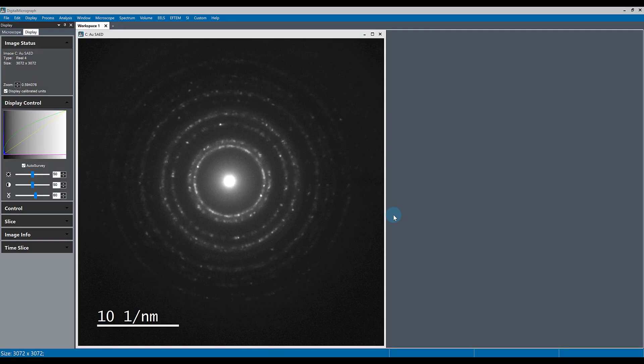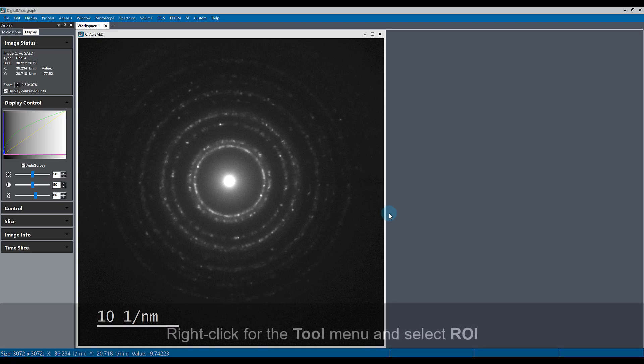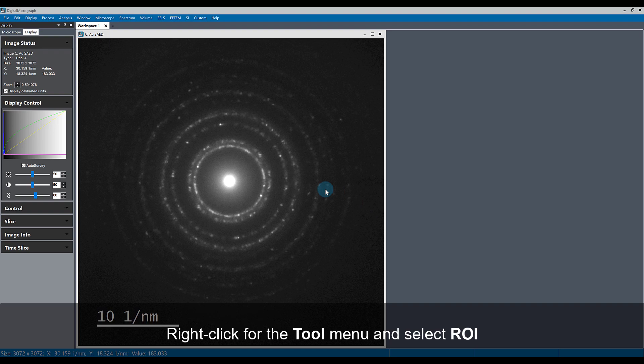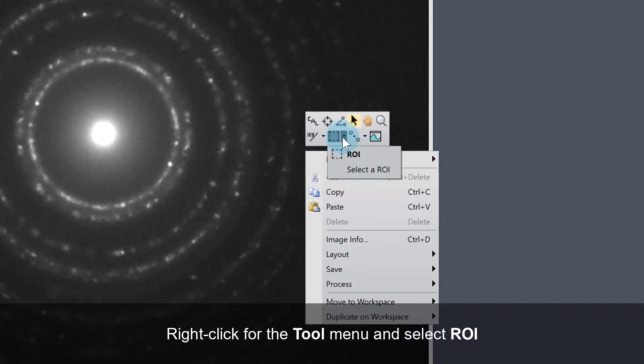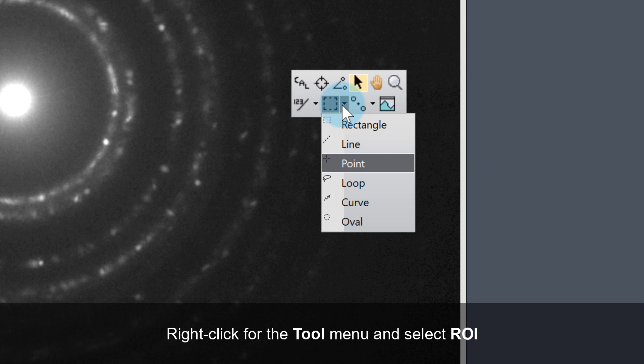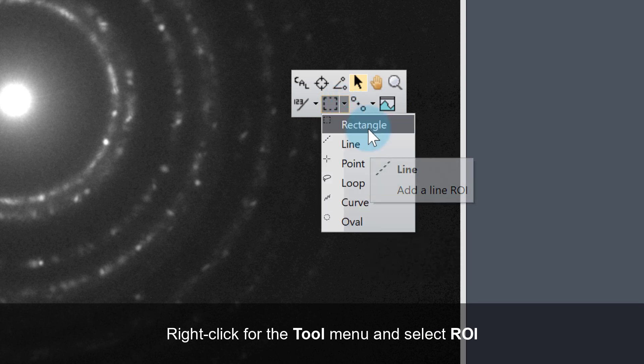If you want to select a specific region of interest or ROI of your image that you're working with, you can access the ROI tool by right-clicking on the image and selecting one of the available ROIs from the menu.